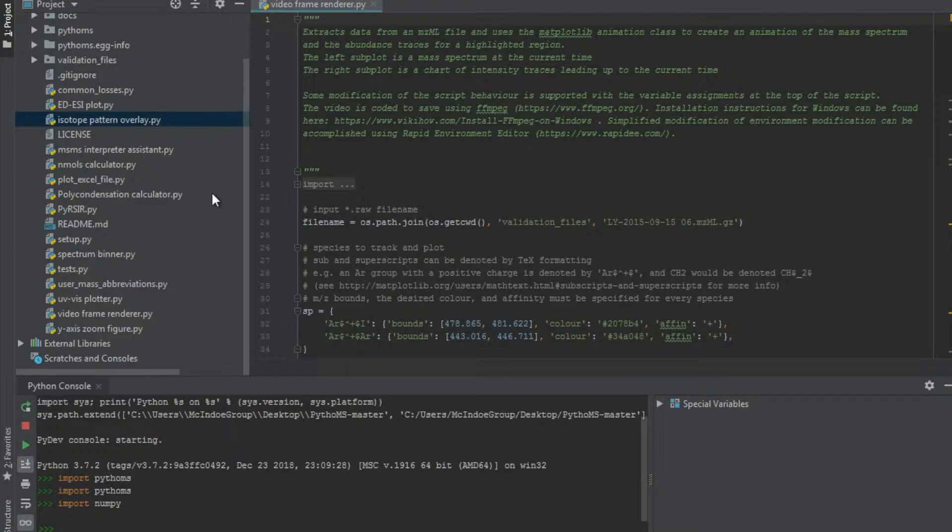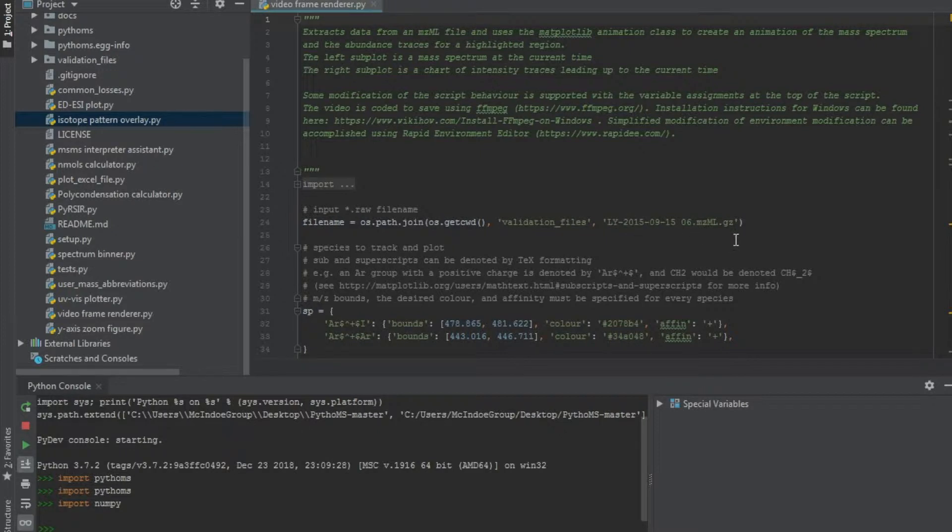There is no need to convert it into one or the other unless the script specifically states that you need the raw file or the mzml, which is the case for the video rendering script.